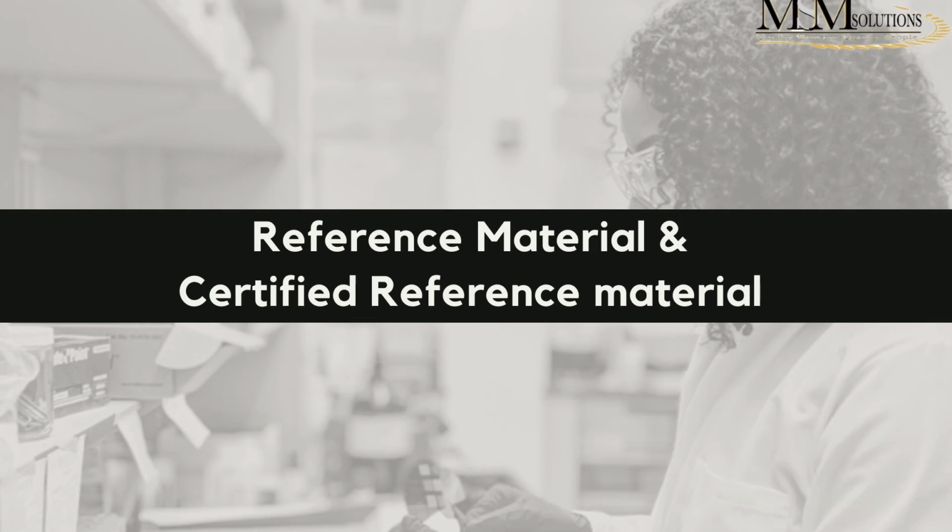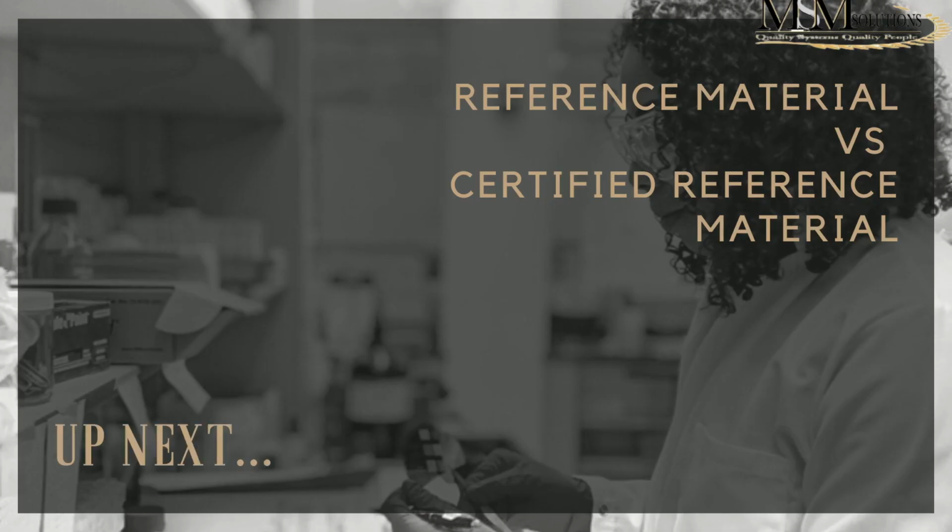This is where we end this presentation. In the next presentation, we'll go deeper into looking at the difference between reference material and certified reference material. We'll look at how we actually prepare reference material. Reference material could be in-house QCs. What exactly are we supposed to do with them? How do we prepare them? How do we use them?